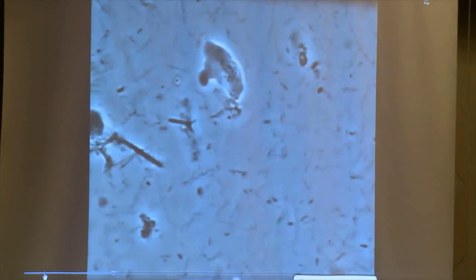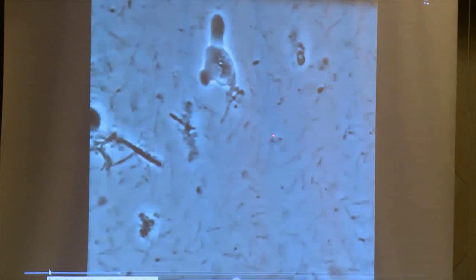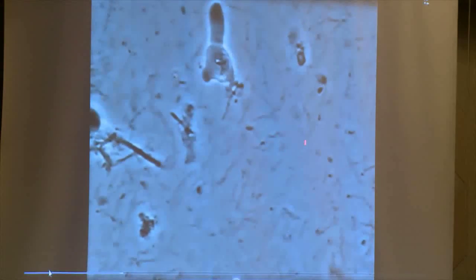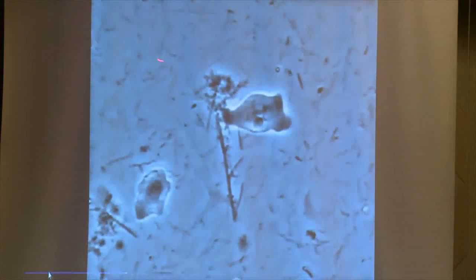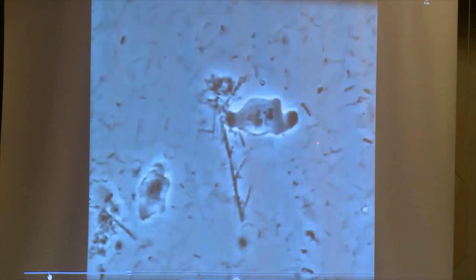So here what you have a look at is you can be able to see the spirochetes, the long corkscrew-like shaped ones. There's different sizes through there. There's the spinning rods moving around. This is an amoeba here moving. Sometimes when you take them and put them on a slide, they do take a while to start moving, but this one is quite active as well.